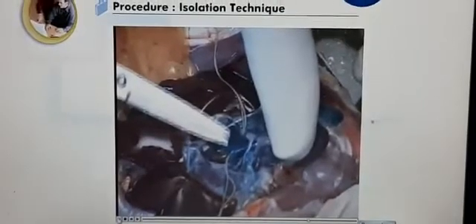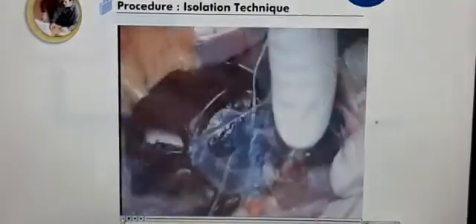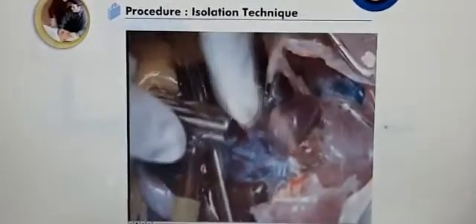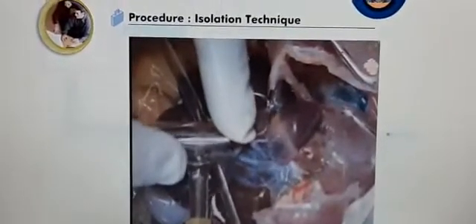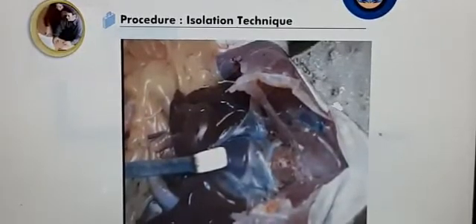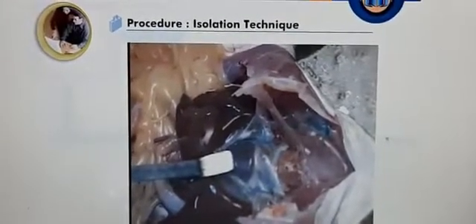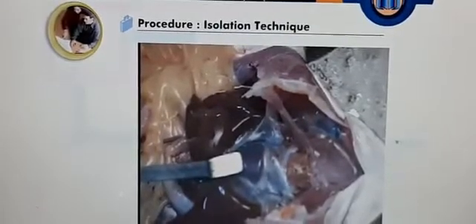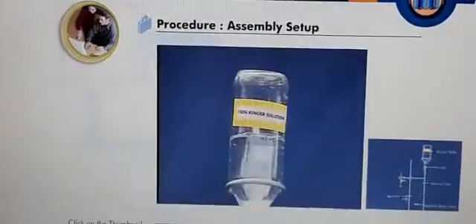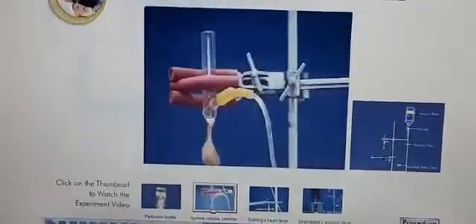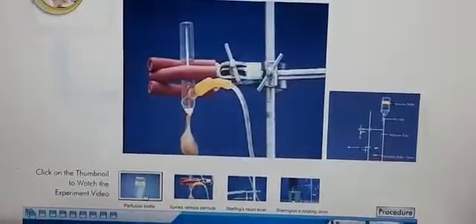Insert the tip of the cannula into the sinus venosus and tie the thread at the groove just to ensure that the cannula is at the proper place. Give a small cut in one of the branches of aorta for the perfusate to come out. Then isolate the perfused frog's heart from its body by cutting the adjacent tissues. Fix the isolated and perfused heart on a stand for the experiment, mounted at a specific height on a round clamp attached to a stand. The perfusion bottle is connected to the side branch of the sinus venosus cannula.